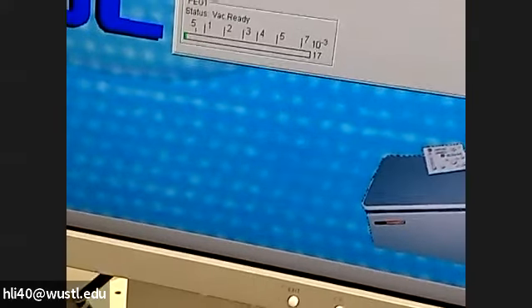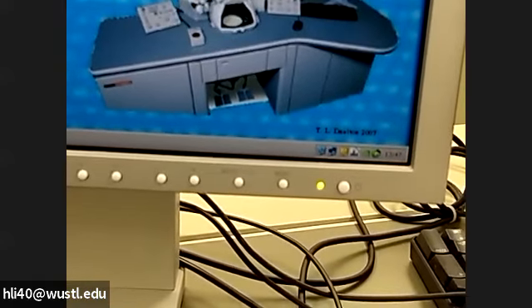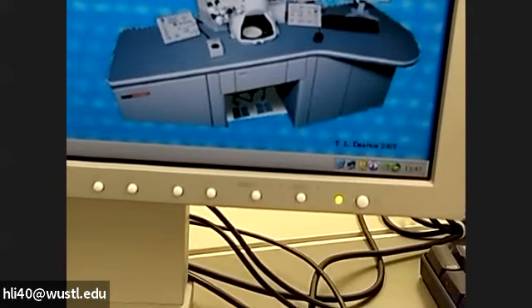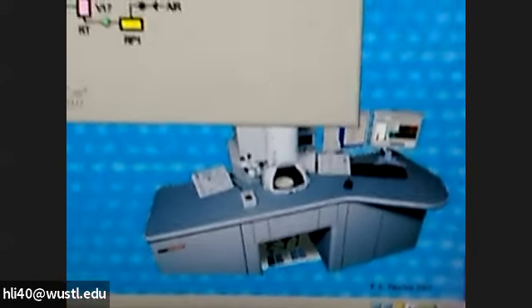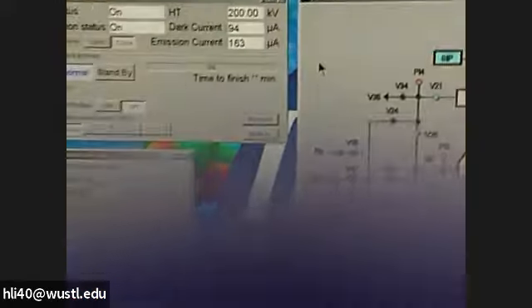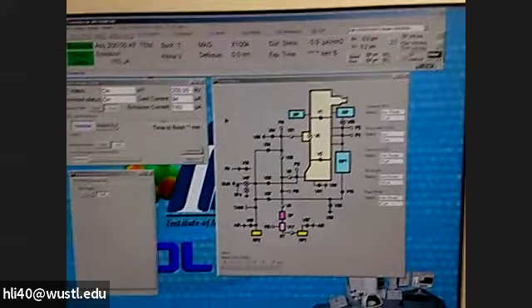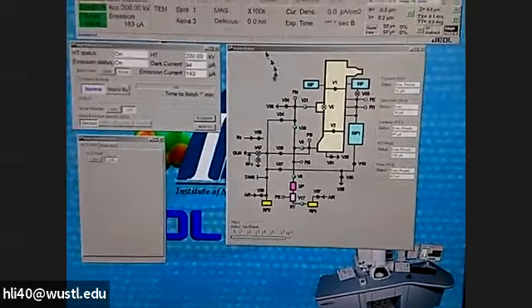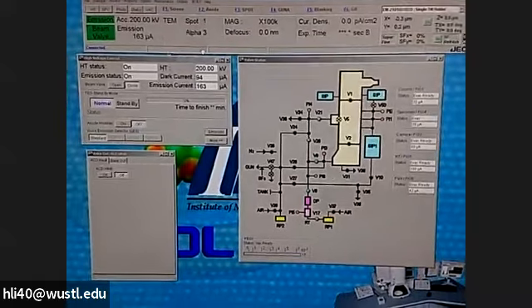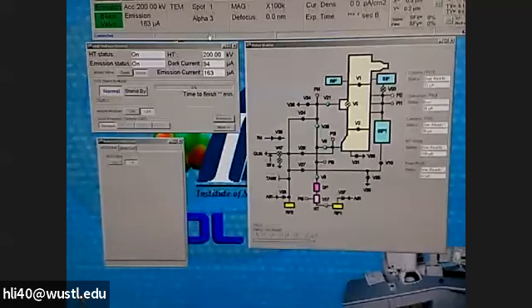So this is the end of your session. If you have a user after you, you don't need to do anything more — just clean up the table and take your stuff with you. If there's no other user, you need to put the instrument to standby, then go to ACD heat. We come back to the software — we need to go to standby.